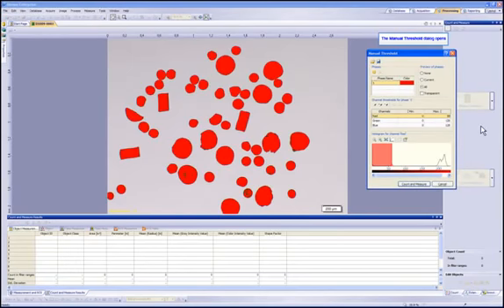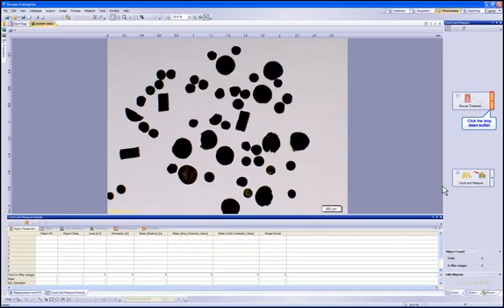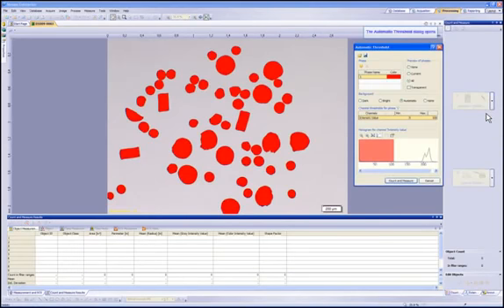With Manual Threshold open, you now have the ability to change the slider covering your histogram to include specific levels of intensity for each color channel, or by selecting to add or subtract ranges with the dropper tools. Let's cancel the manual threshold to use the automatic mode. Again, select the drop-down to choose the automatic threshold mode. Since automatic mode works very well on this colored image to detect the threshold of each particle, we can now simply select Count and Measure to perform the particle counting.